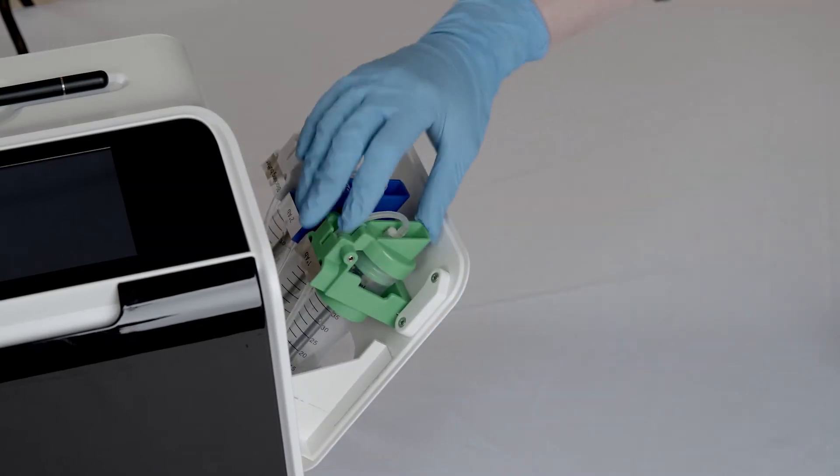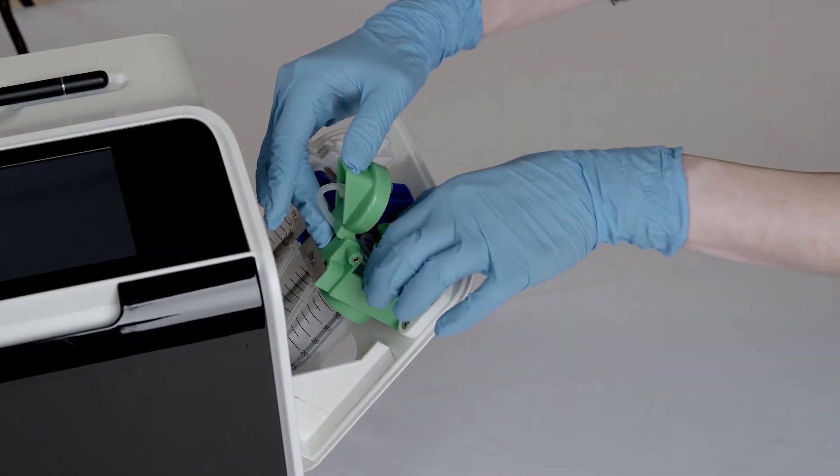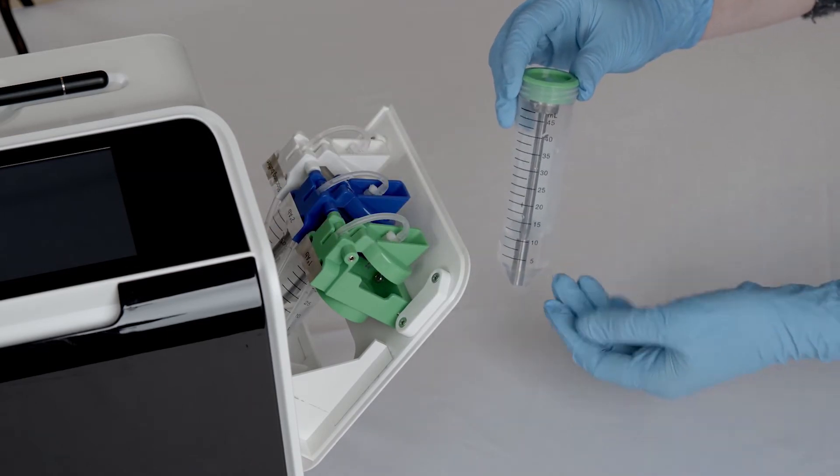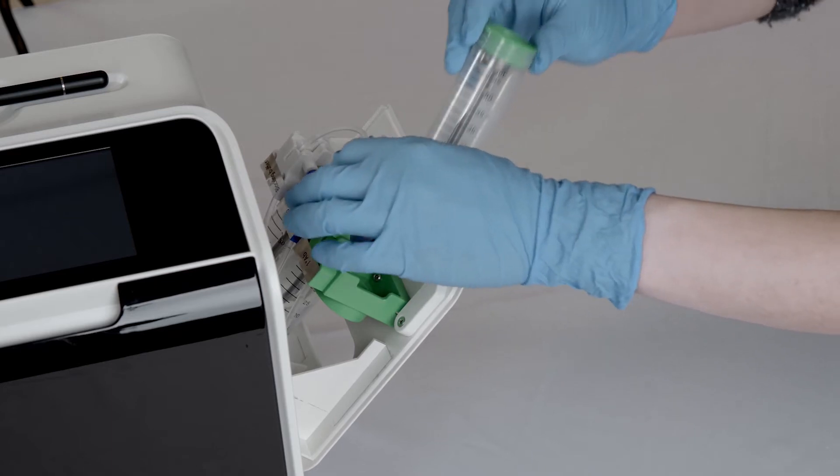On the side of the instrument, pull out the cartridge and load the blocking buffer, primary antibody, and secondary antibody reagents. The minimum volume requirement for each reagent is 10 ml.